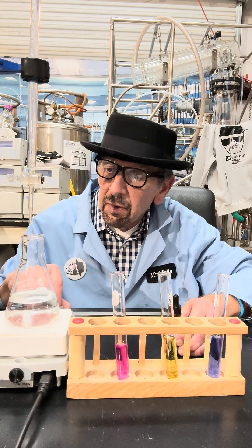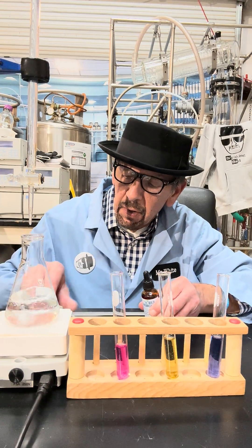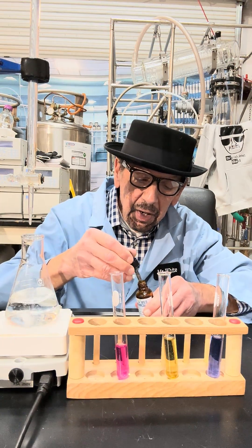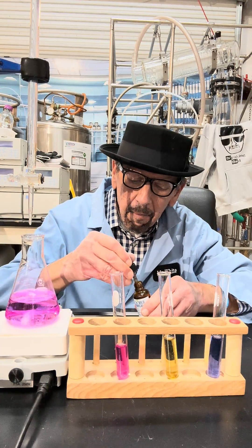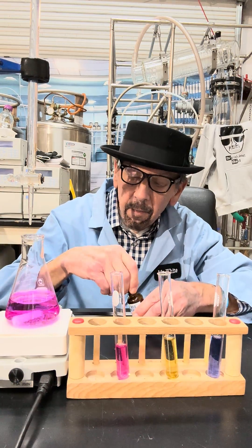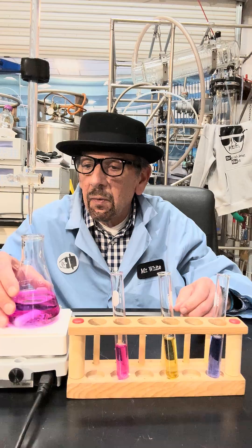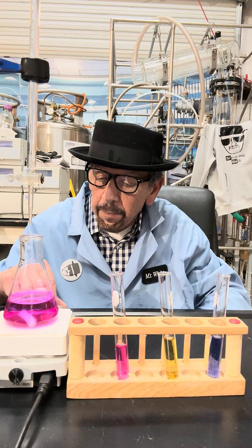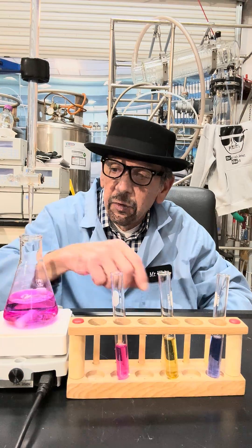We have a dilute acid solution. Add some indicator, and you can see it's red when it's acidic. And we're going to titrate with dilute sodium hydroxide. You'll see the color change from red to yellow to blue.